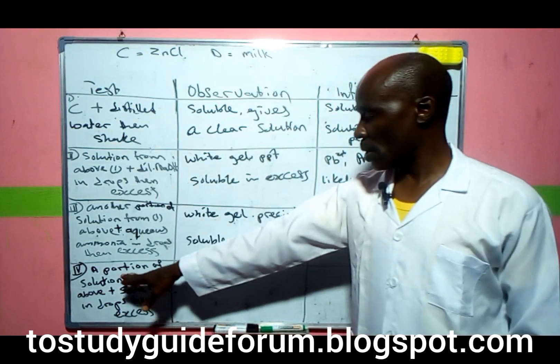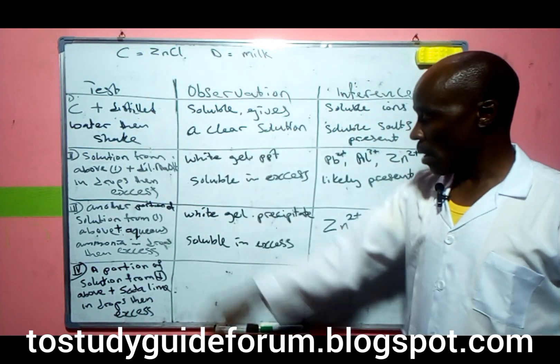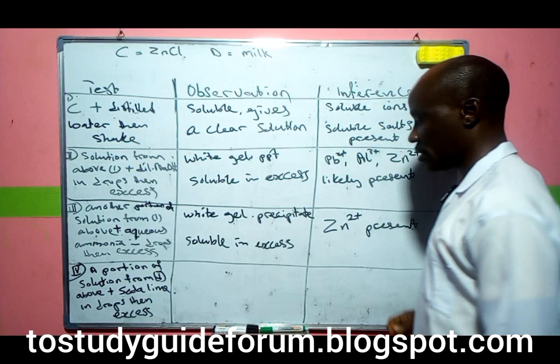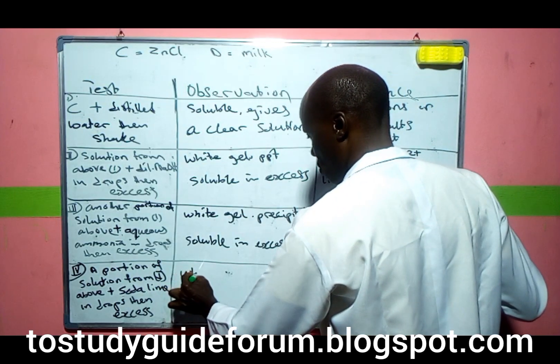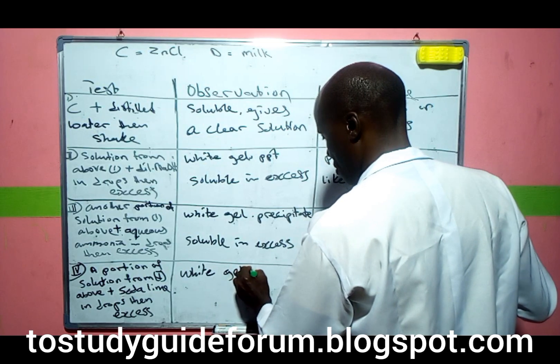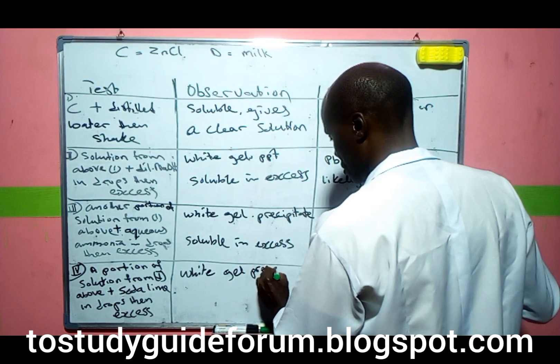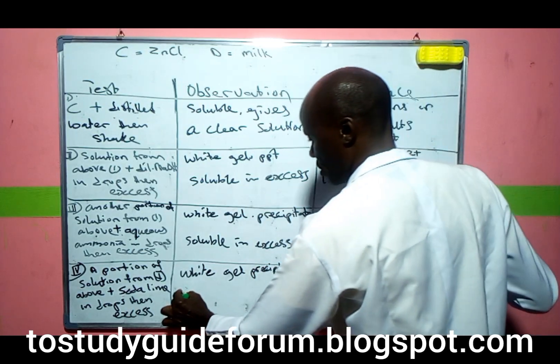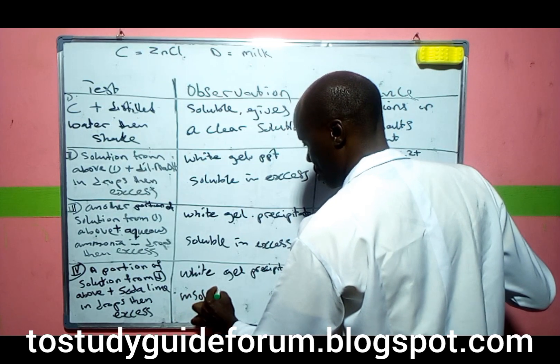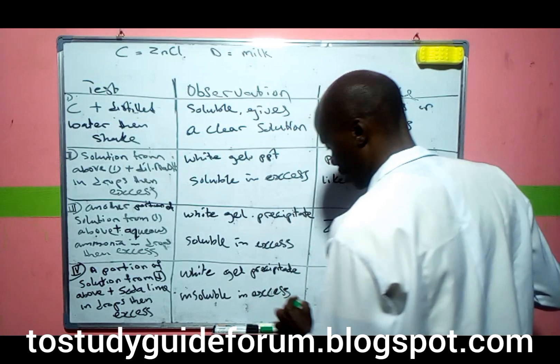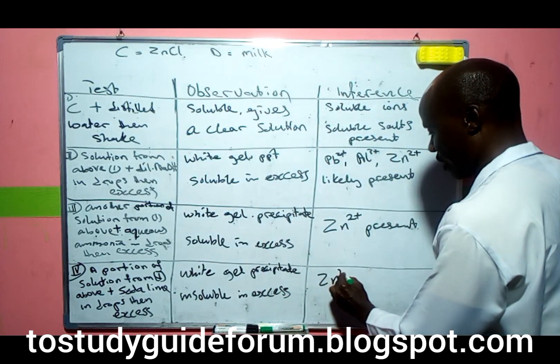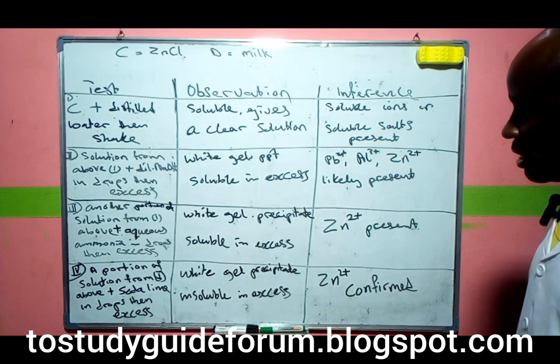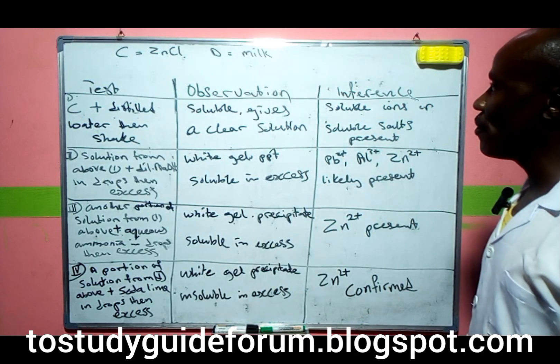In the last portion, we add soda lime solution in drops. We observe white gelatinous precipitate that is insoluble in excess. This confirms zinc ion is present. So what we have in salt C is zinc ion confirmed.